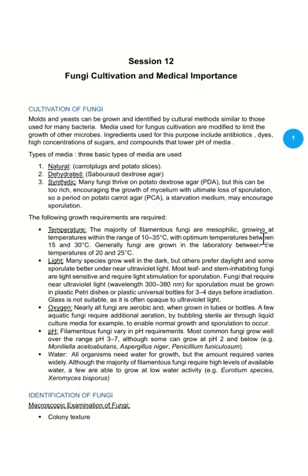So if you want to study the spores of these fungi, you need to plate or culture them on what we call a starvation media, which contains less nutritive value. A type of this medium is the potato carrot agar. That one is potato dextrose agar, which is very rich in sugar, and the other type is potato carrot agar.